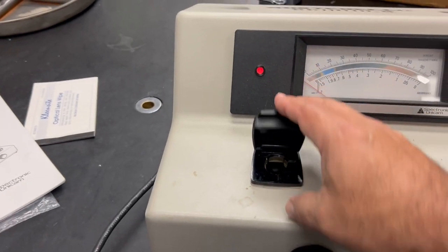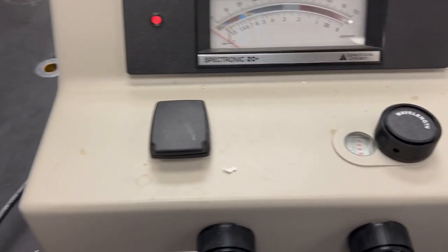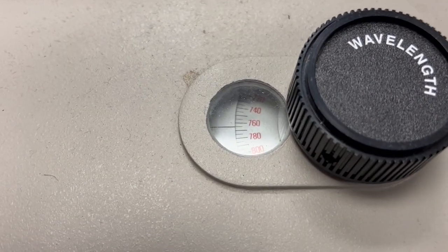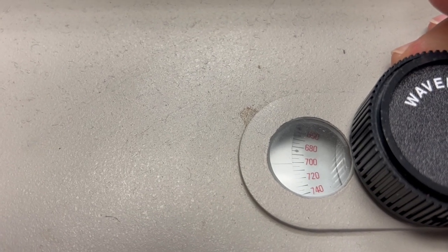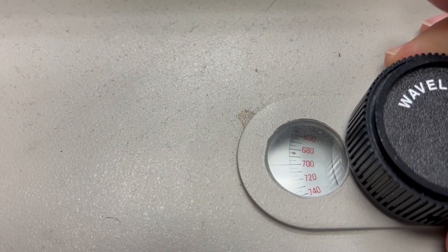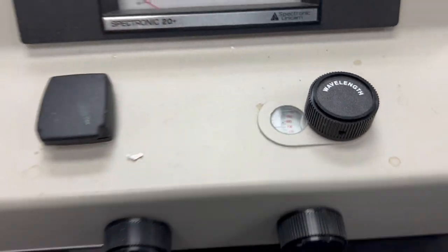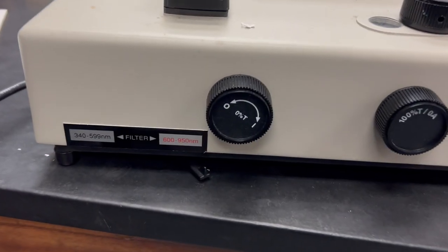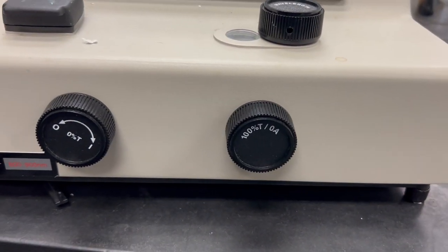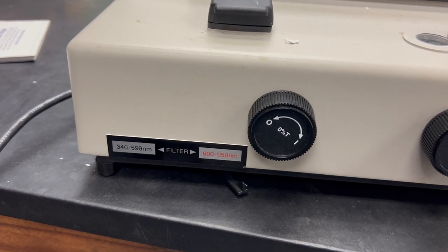You close the cover on the sample container. Make sure you have the right wavelength first — it should be set to 700. There are a couple of knobs in the front: the zero knob and the hundred knob. The zero knob controls zero percent transmittance, which is when the shutter is closed inside the machine.